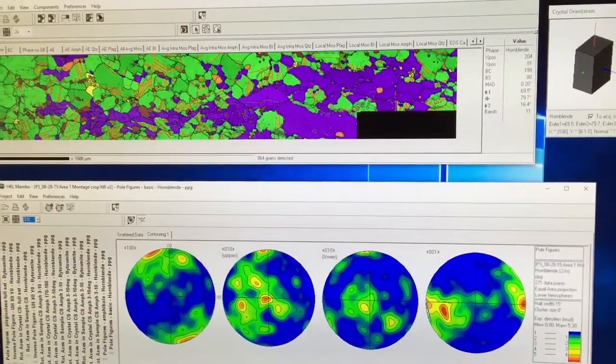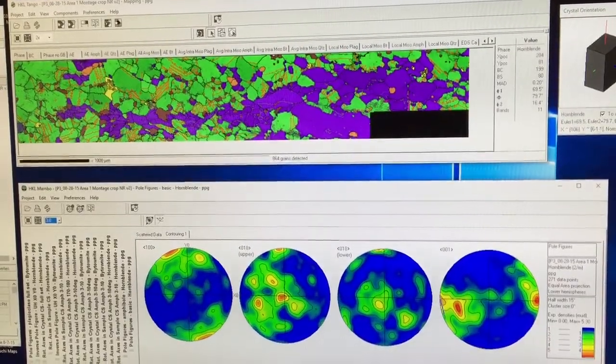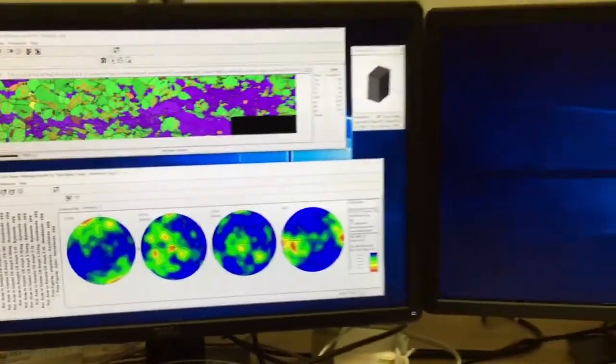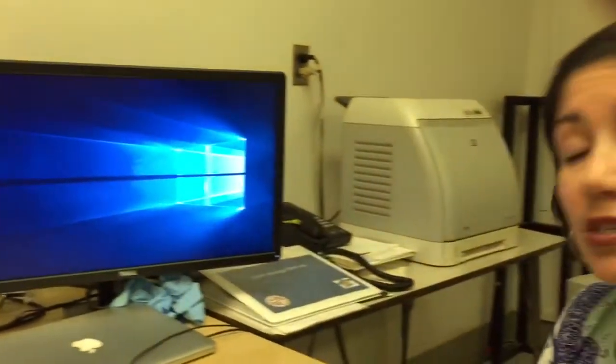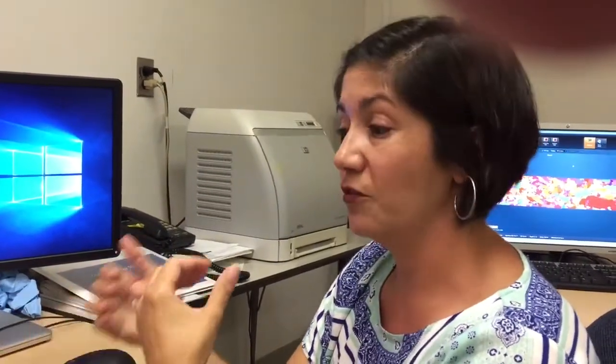That's where the bulk of your A axes and your C axes sit with respect to the horizontal and vertical directions of the map. Now you can compare that with your calculated grain shape preferred orientation for the hornblende, which you'll do with a separate software program. So you can compare shape preferred orientation with crystallographic preferred orientation and answer the question, is the elongation of the grains linked to a crystallographic direction of the hornblende or not? And if it is, that tells us something about the process that occurs to give that foliation to the rock. Okay, have fun calculating.